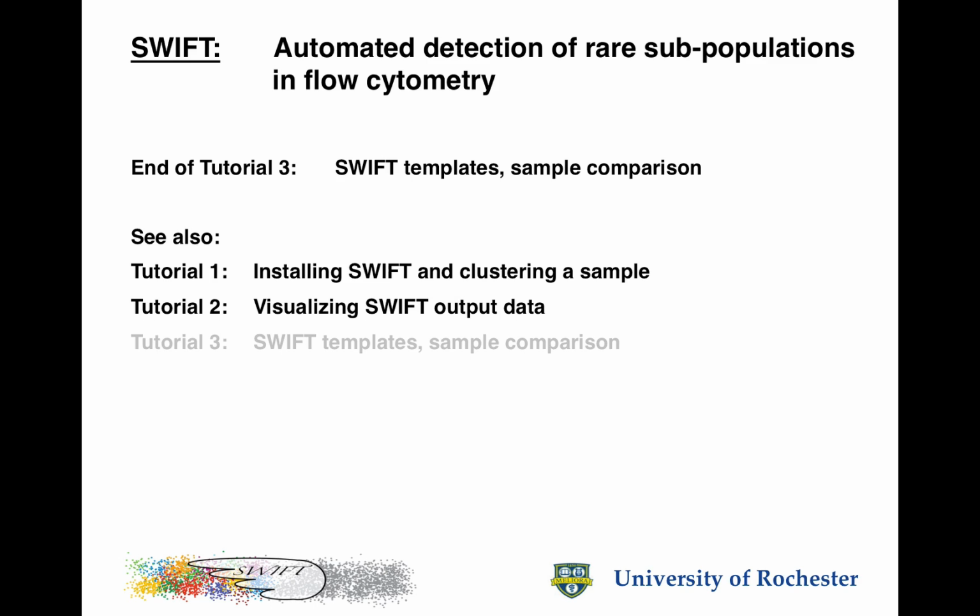So that concludes tutorial 3 on the use of Swift to prepare templates and compare samples. And I'd remind you that tutorial 1 and 2, if you haven't seen them already, tutorial 1 is installing Swift and performing basic clustering. Tutorial 2 is visualizing the output data from Swift.